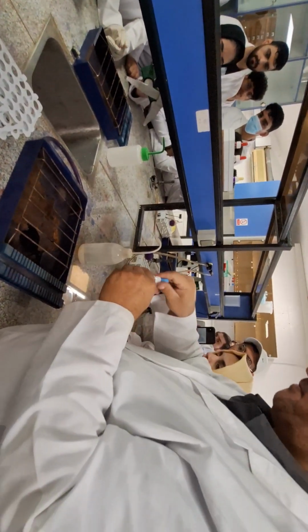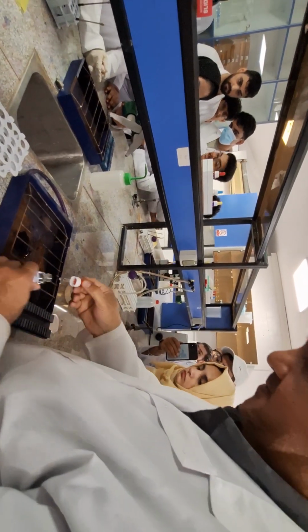Then the second is iodine. Add iodine, time 1 minute, then wash. Number 3 is alcohol. The time of alcohol is very important: use 5 to 10 seconds. 1, 2, 3, 4, 5. Wash it.